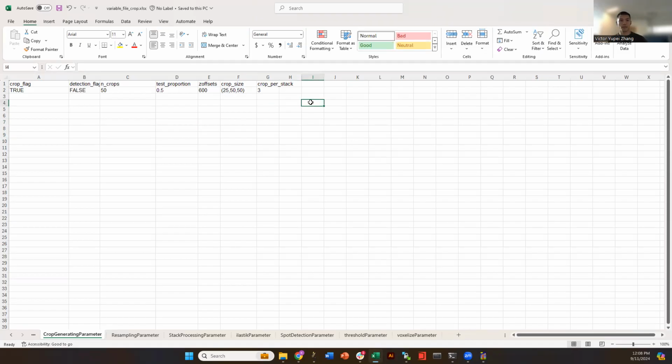Okay. One thing is that having total background images, or images from the edges of the brain, is fine. That will give you more of a negative control. You don't want the edges to be falsely identified as positive cells, so those will serve as a good negative control.